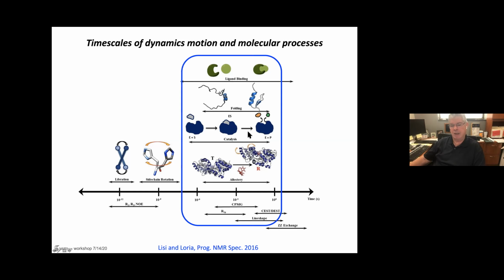And it's this area where NMR is particularly valuable, and I think most of you that have logged into this will clearly know this. This is not new at all. And we have a range of tools. Now, in the slow end of the exchange range, the CEST, chemical exchange saturation transfer, and DEST, the dark state exchange saturation transfer, are very powerful methods.